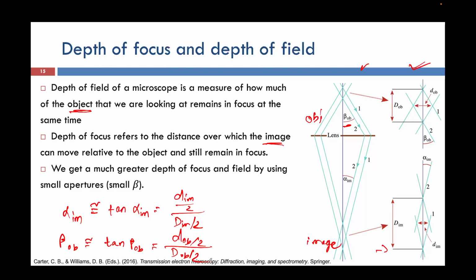These are the two angles, by calculating the distance from the screen to our material and where the gun crossover is happening, we can calculate alpha, the convergence angle. And by calculating those things we can calculate the angular magnification.